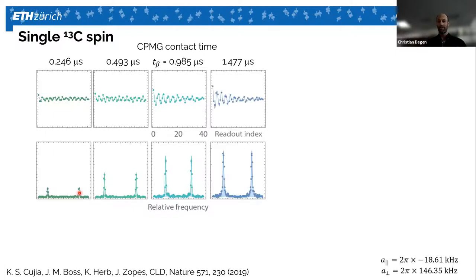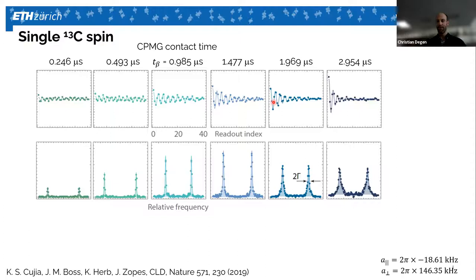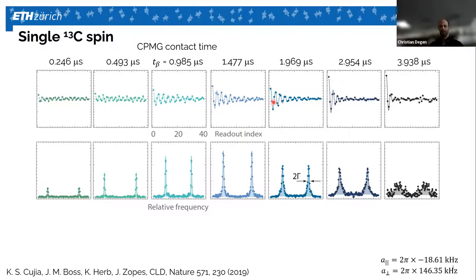You can also go the other way. The signal increases, but now the decay is faster. And if you increase this more and more, you get a very large signal, but the signal decays extremely rapidly. So the gist is that I can take a detector and measure the nuclear spin very strongly, but then my precession is killed within a few cycles. I can measure very weakly, I don't get much signal, but the nuclear precession is hardly perturbed, the spin just keeps precessing. And there is an optimum, as you can see in the middle here somewhere, where I have a good balance between some dephasing, some decoherence of the nuclear spin, but still adequate signal.